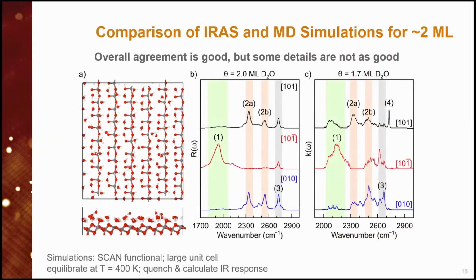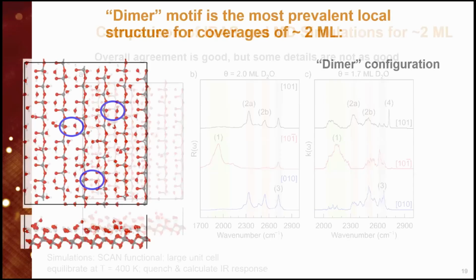They can calculate the IR spectra for that simulation. That's here, and you can notice there are some really strong similarities. There are the strong hydrogen bonds across the row, all right? There are these other hydrogen bonds in the intermediate range, these peaks here, and we get the stuff up over here. Okay, now the great thing is that the theorists can do some very specific things.